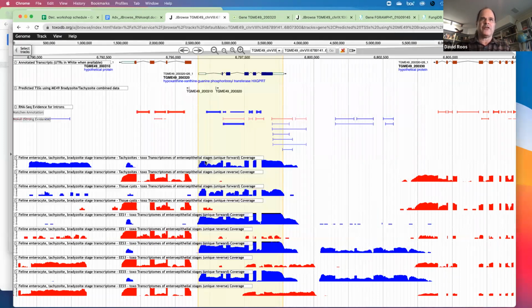You can see a pattern similar to there, here, and possibly here, coordinate with this predicted start site. So it's almost certainly true that there is a low-level transcriptional start site here. And of course, if we start transcription within the intron, this intron can't be excised, but the protein coding sequence will be maintained.